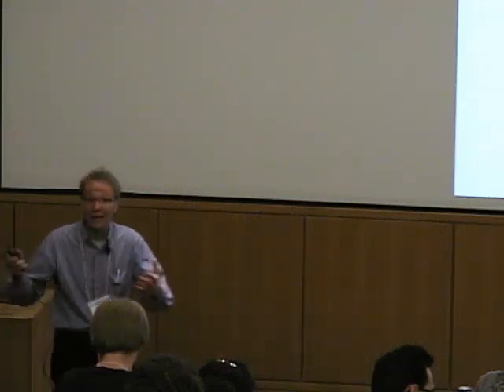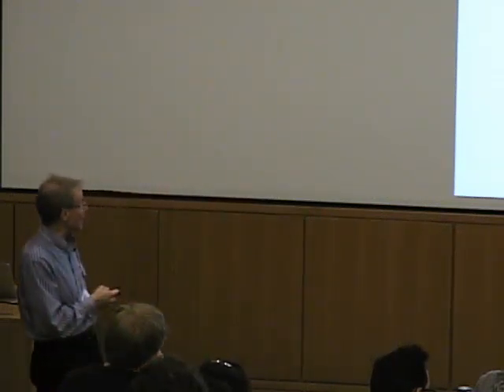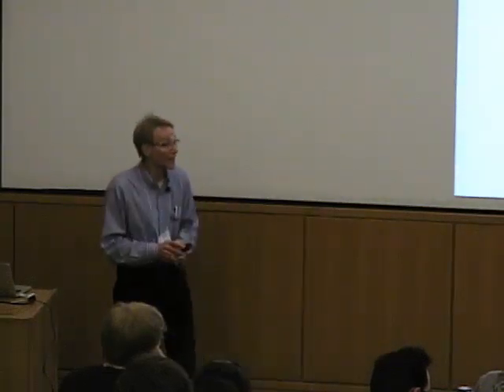So basically, this is the data that we can use for analyzing our data when we work with metals in this buffer, to subtract out the buffer interaction with the metal. And just something that we recently published from my students in Methods in Enzymology, which basically has a big table of this type of information. So it's a good resource for pulling out that information.